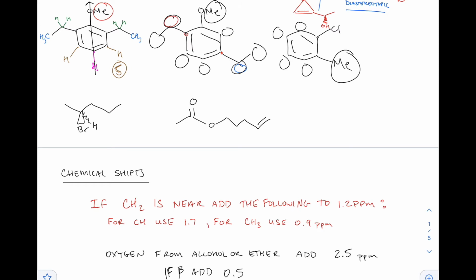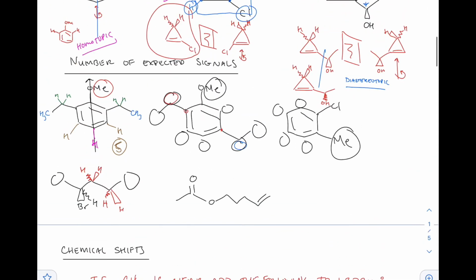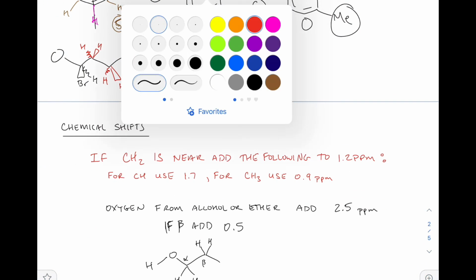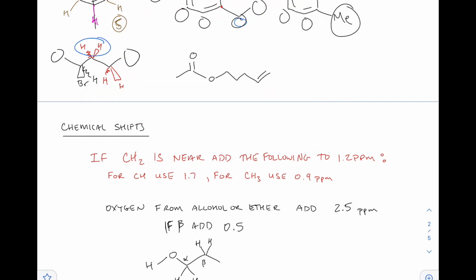So there's a hydrogen there, so that's 1, 2, and then 3. Since these right here, basically, long story short, by definition, these are diastereotopic. So these are different than these ones. That's obvious because these ones are closer to the bromine, but they're also different from one another.